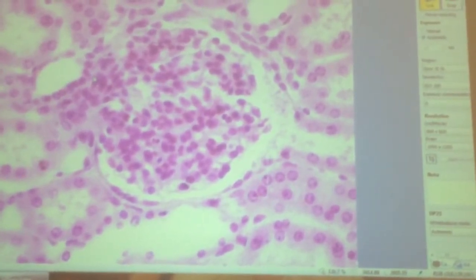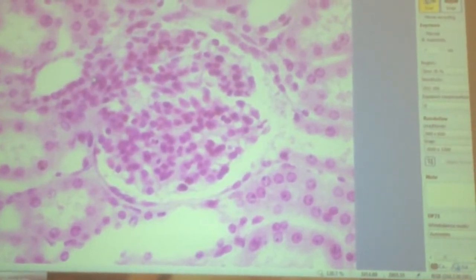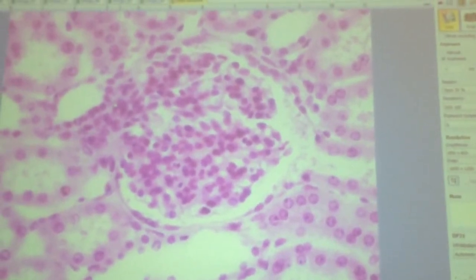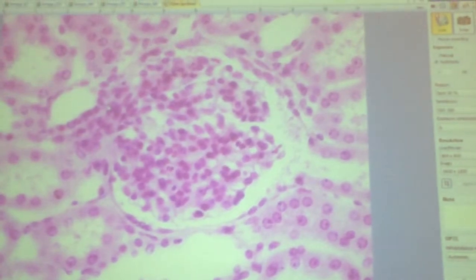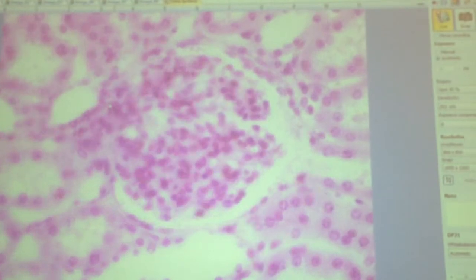We didn't see the ureter, but we saw the first part of the calyx here with the transitional epithelium. We got everything else, right? Not bad. Collecting ducts, papillary ducts, collecting ducts running through the medulla. Okay, do you guys want to do the other two, even though we haven't talked about those organs yet? Ureter and bladder? Let's do it.